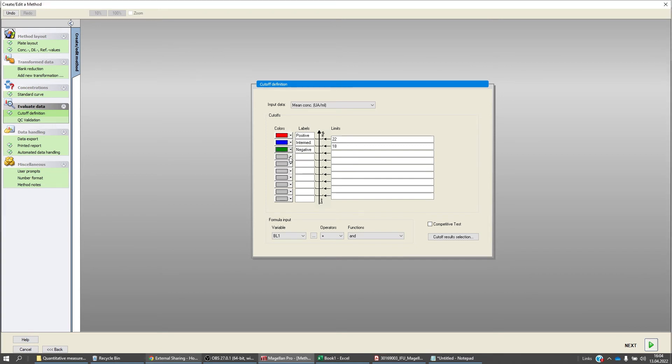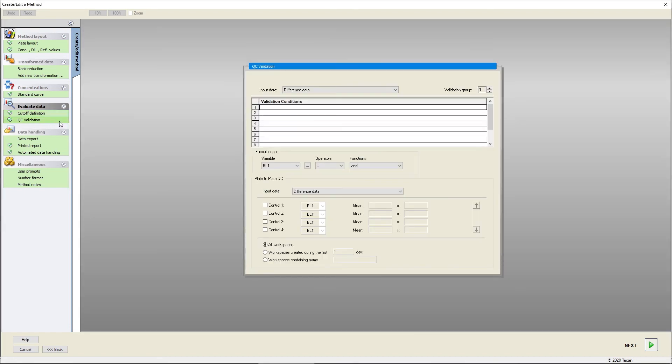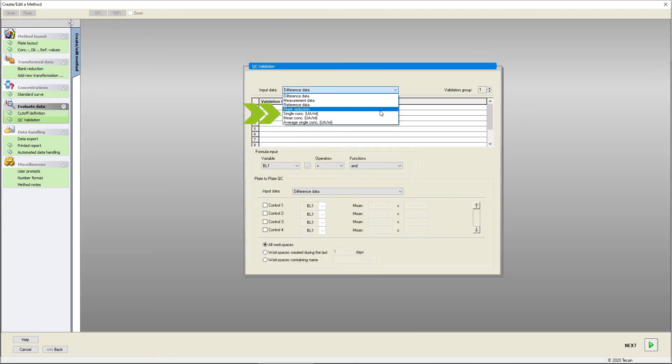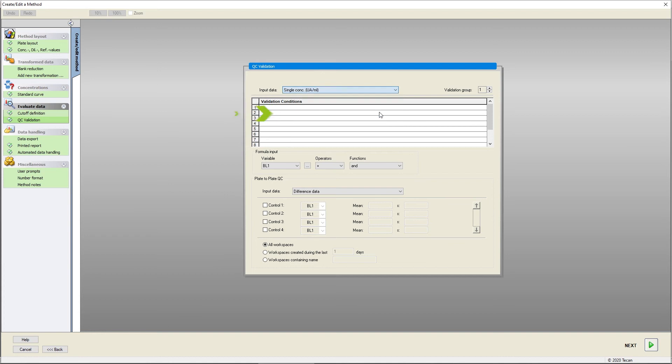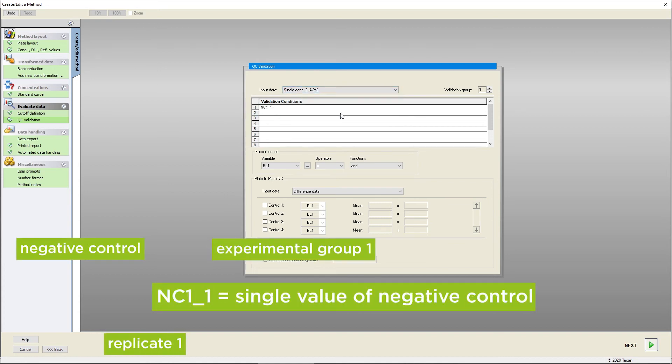Your assay description might include a QC validation. Again, make sure to select the correct input data. You can define the QC validation for single values. In this case, the calculated concentration of both replicates of the negative control must be below a certain concentration value.